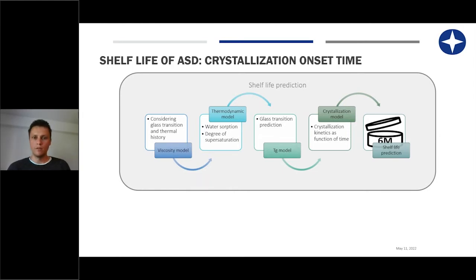You see the main driving factors summarized here on this slide. This is, for example, the viscosity of the polymeric matrix. The polymeric matrix as such is a viscoelastic fluid, which has a solid appearance. So it's a powder in the end from the haptic appearance, but it is a glassy formulation, and therefore we need to know the viscosity of this polymer matrix, ideally even under consideration of the thermal history. This means how we manufactured the formulation and how we processed it.